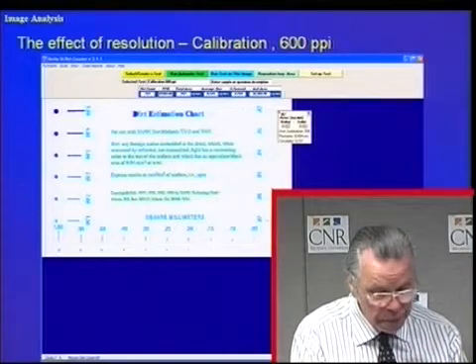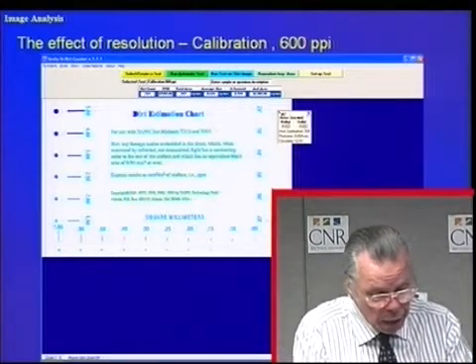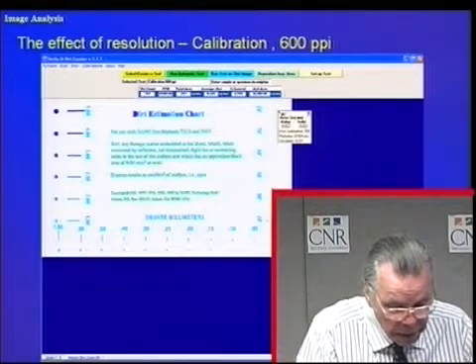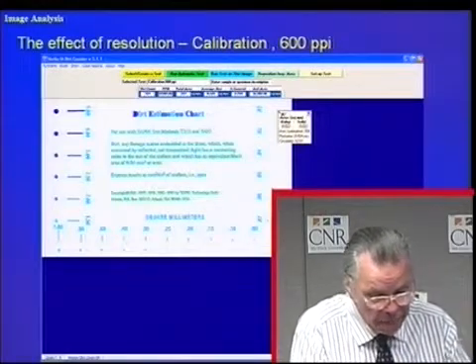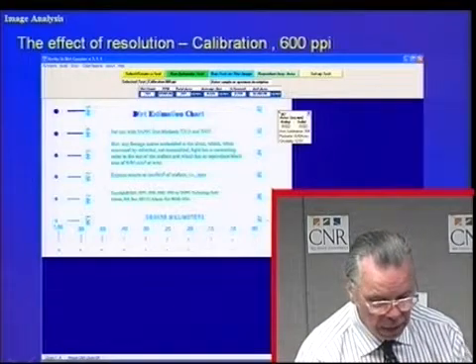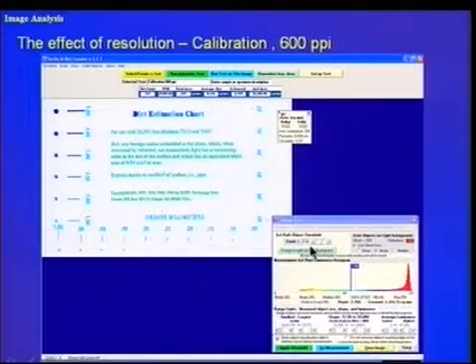You see here, to acquire the dot accurately, to emulate what is on the card, we can set the threshold at 105 and a threshold of about 138. This gives us a reading of 0.022 square millimeters.